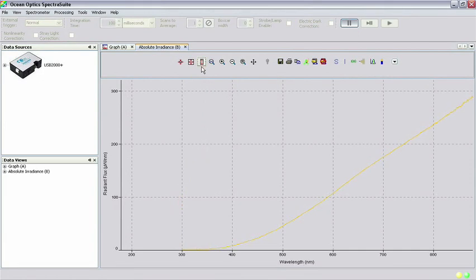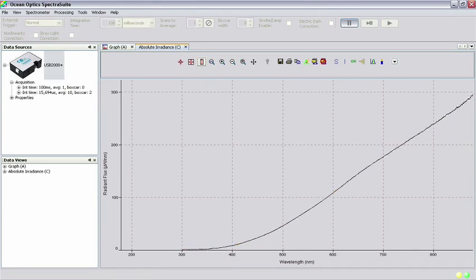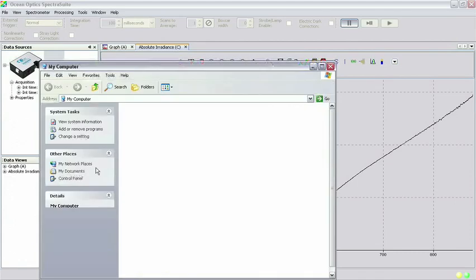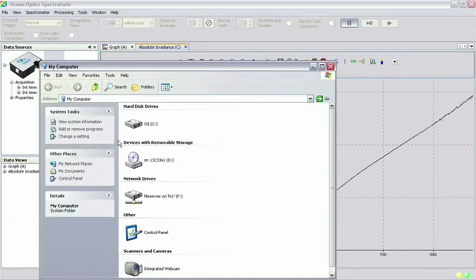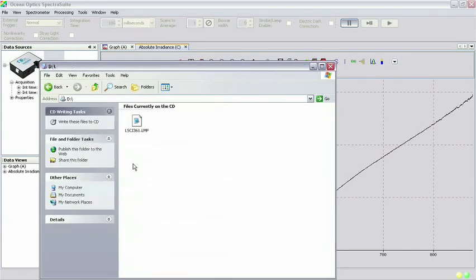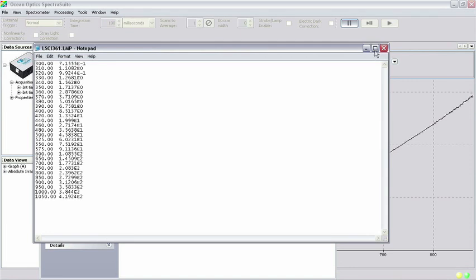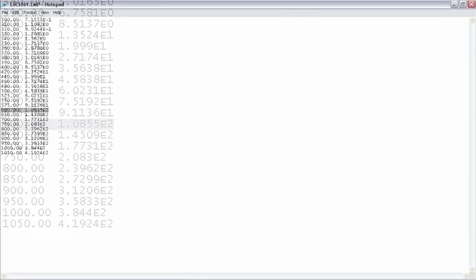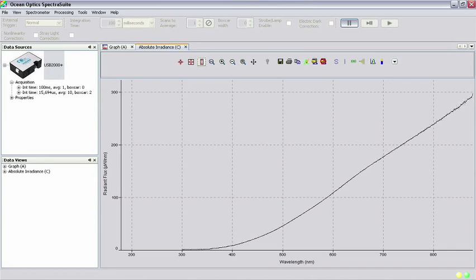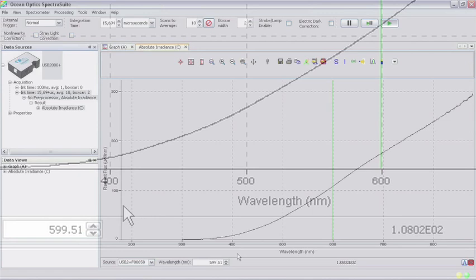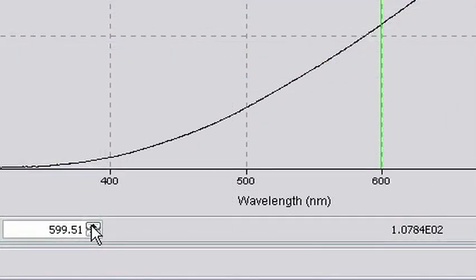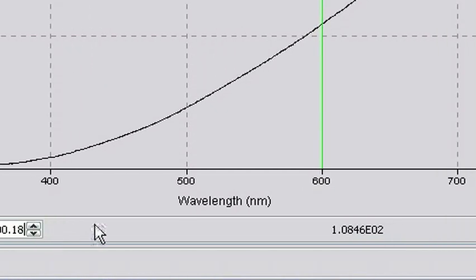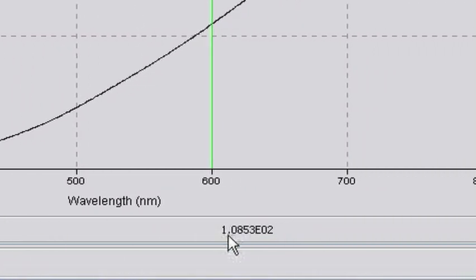A good check to see if you have performed the calibration correctly is to cross-reference the values listed in the lamp file with the values being measured in SpectraSuite. For instance, our lamp file shows a value of 108.5 microwatts per nanometer at 600 nanometers. Clicking on the spectrum graph at 600 nanometers to activate the cursor, we see that the value at 600 nanometers is approximately 108 microwatts per nanometer. Therefore, it appears we have done the calibration correctly.